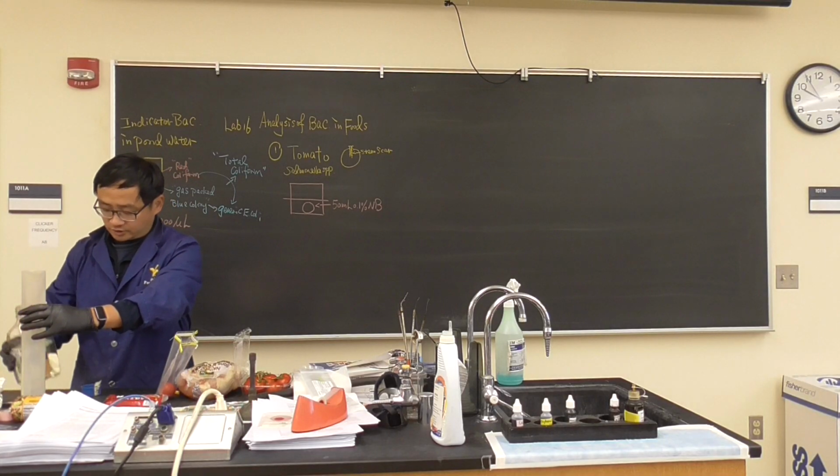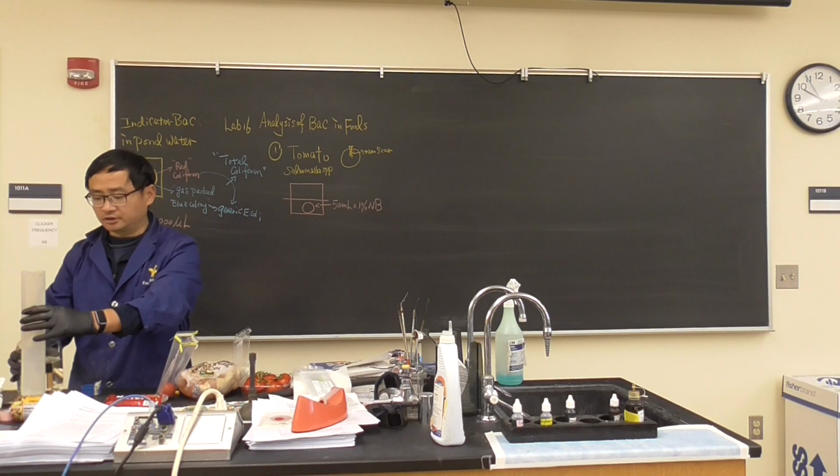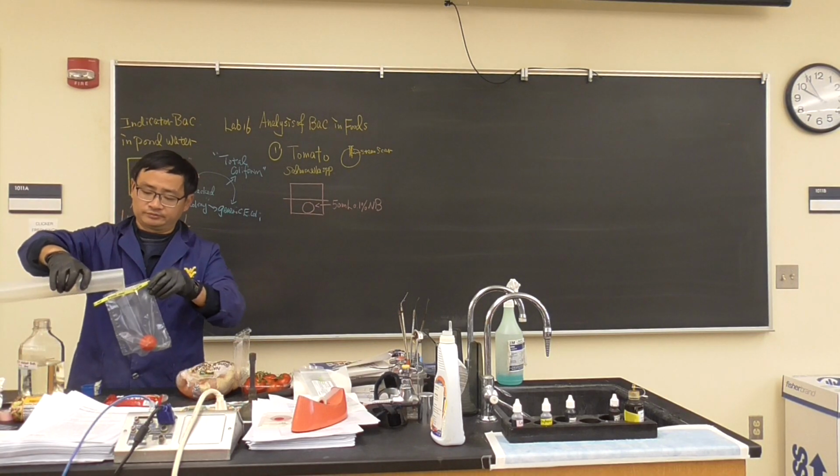We have to add the solution. So we add 50 ml. Just use a cylinder. This cylinder is autoclaved. So we added.